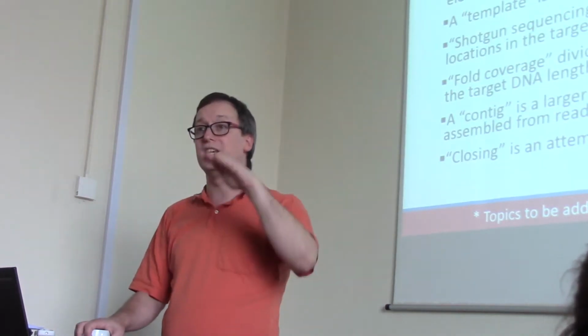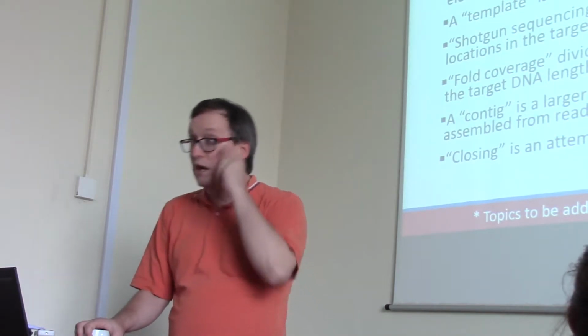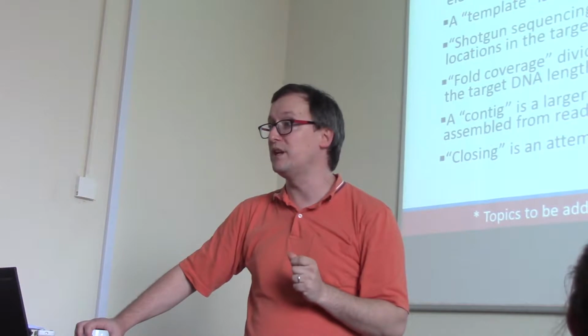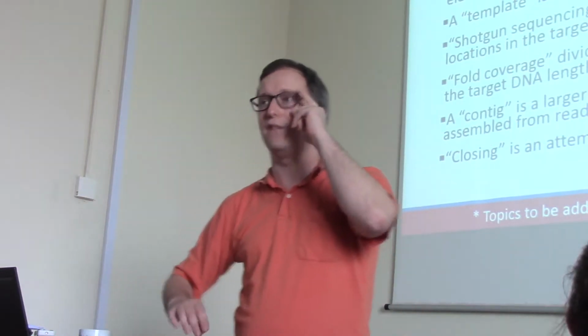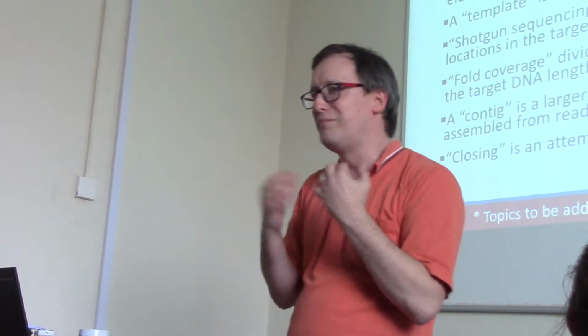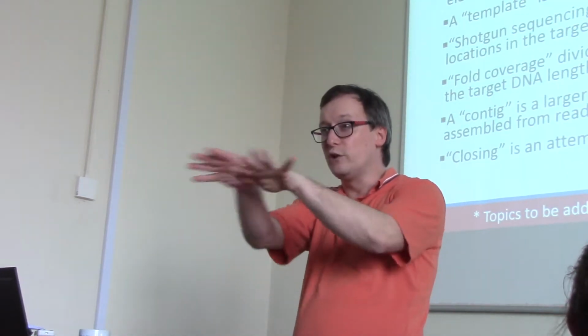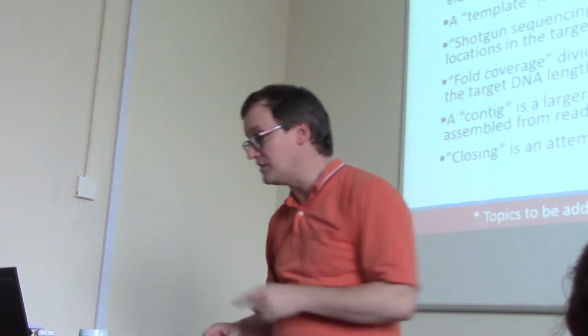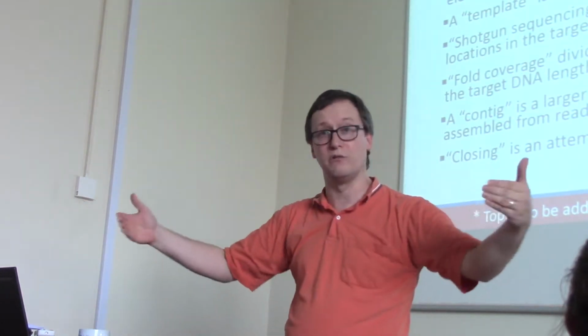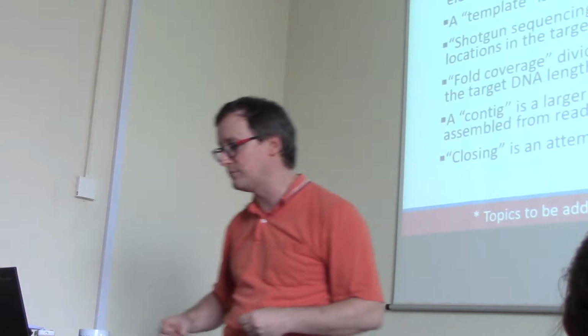than you would if you had very low fold coverage. Contig is a term that's going to show up a lot tomorrow when we're talking about assembly. Contigs refer to the fact that these individual reads are not going to remain by themselves for long. We're going to be looking for ways that they overlap. And so contigs are going to be built that stitch together short read sequences to make a longer stretch.